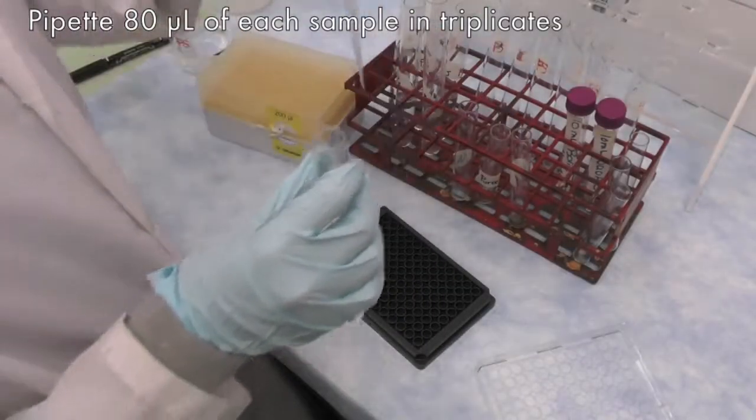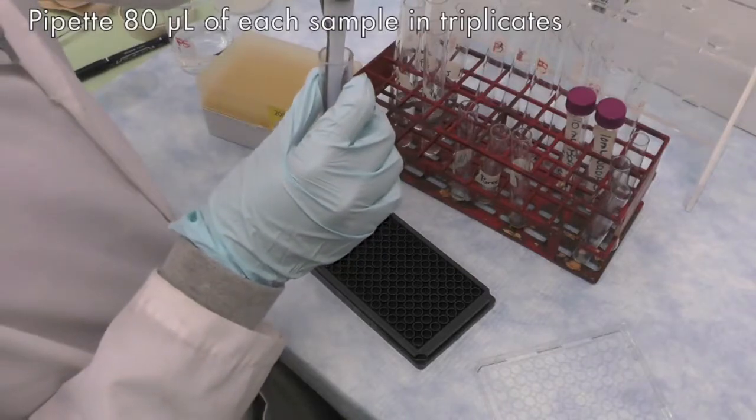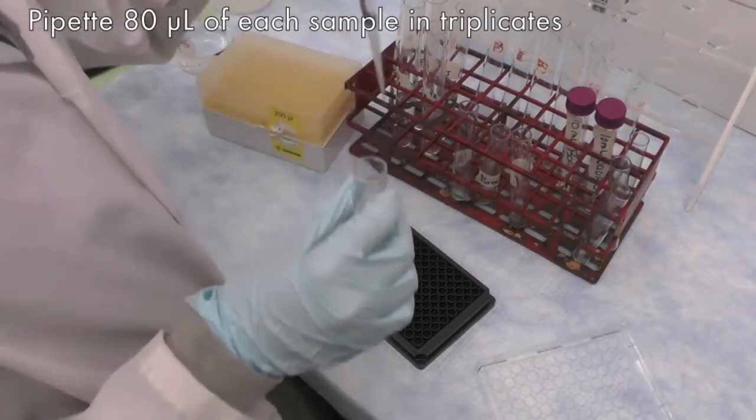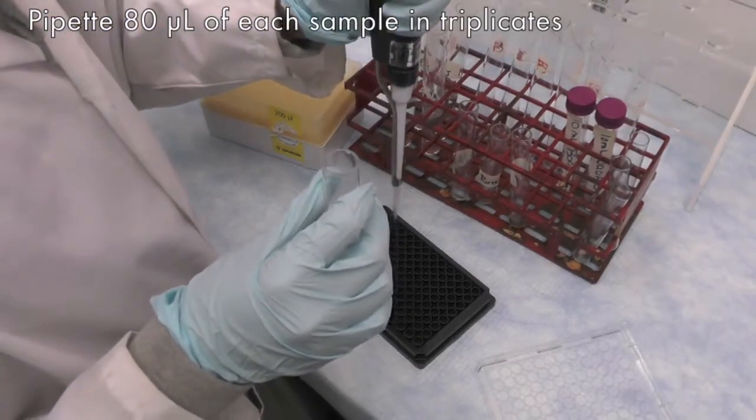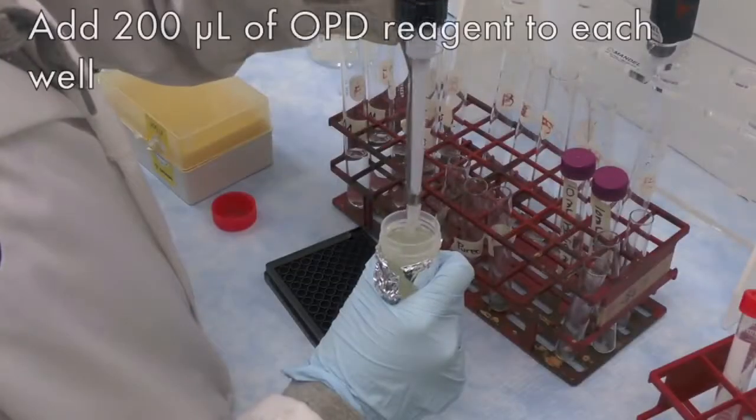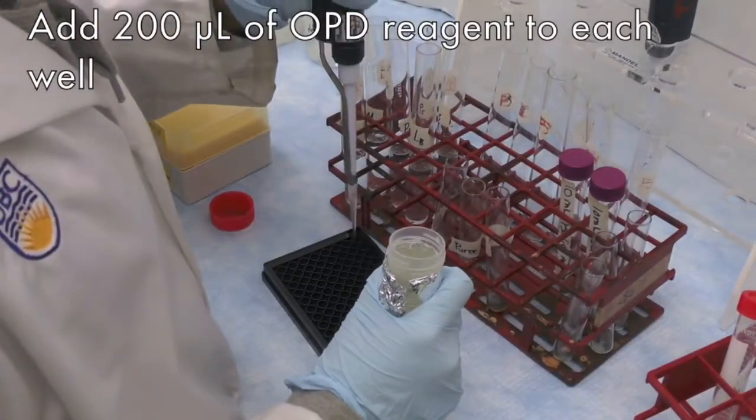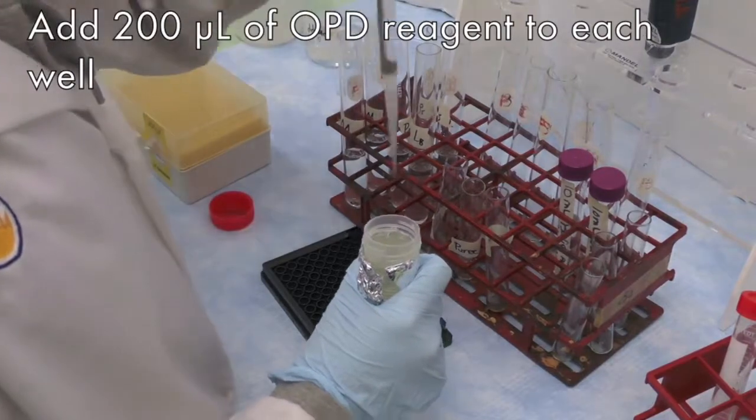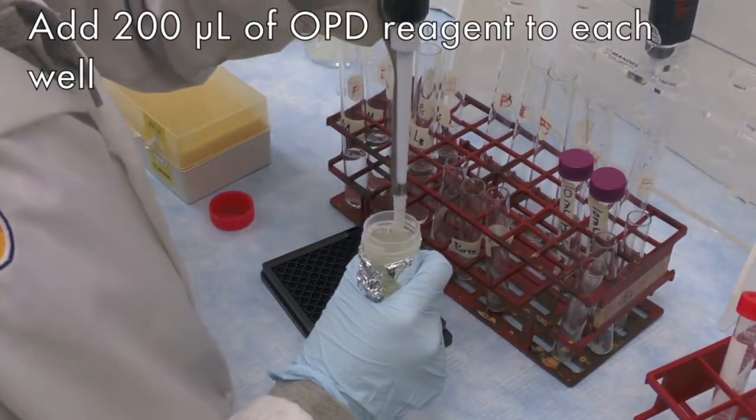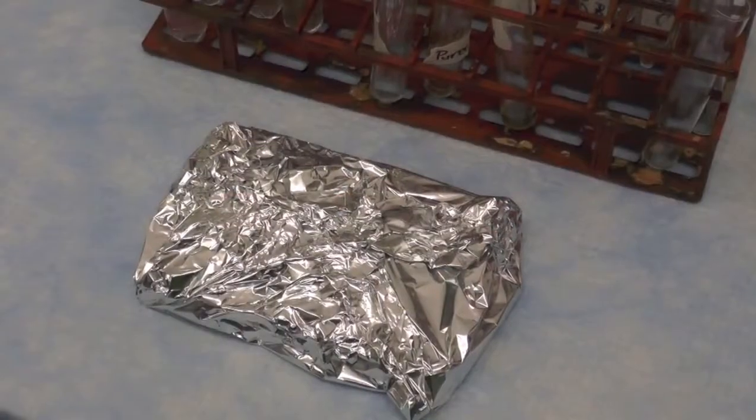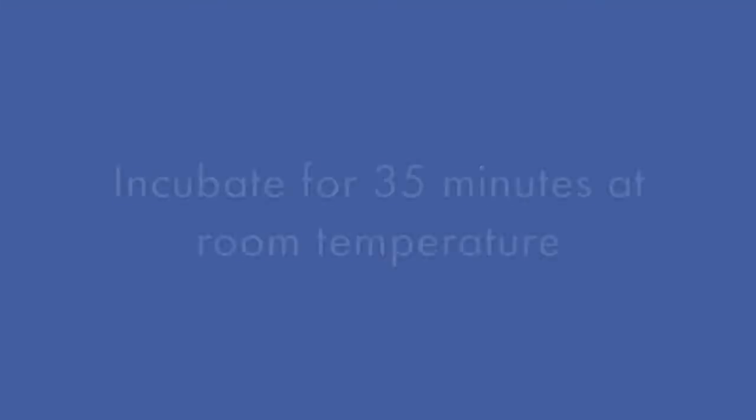For the sample blanks and sample dilutions, pipette 80 µl of them into the microplate in triplicates. Add 200 µl of OPD reagent into each well containing solutions. Then cover the plate with aluminum foil and incubate for 35 minutes at room temperature.